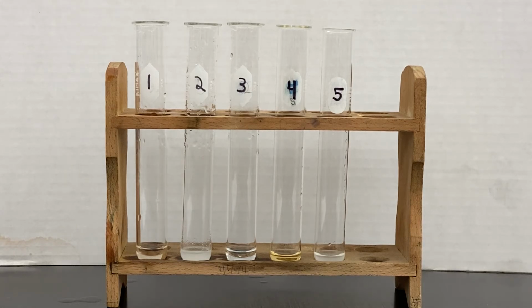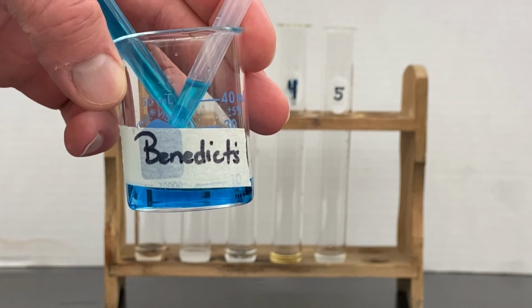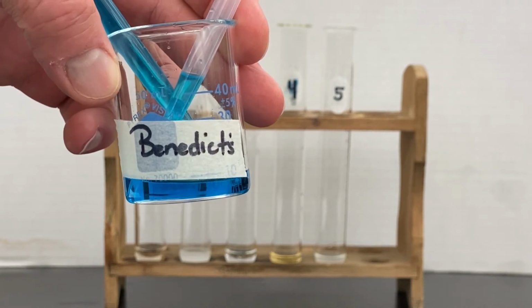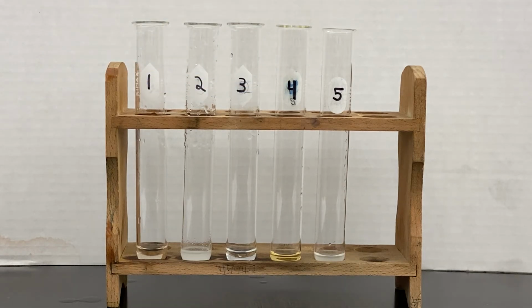All right, now we want to see how these behave with Benedict solution. We know that Benedict solution is good at indicating monosaccharides, so I'm going to put 30 drops of Benedict's into each test tube.